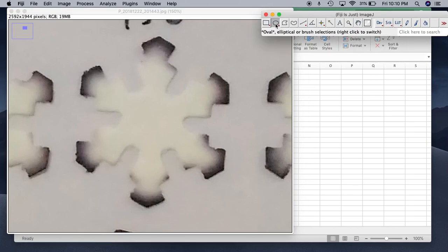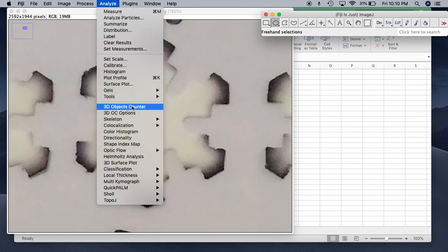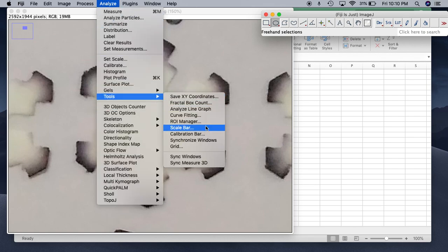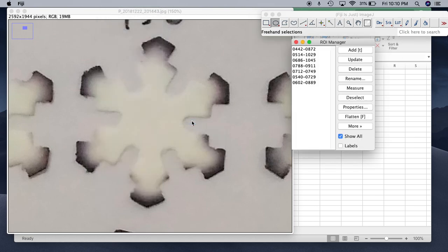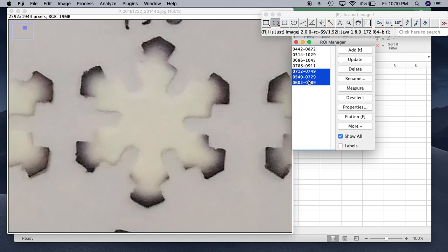Now the second thing I'm going to do is go to Analyze, then Tools, and ROI Manager. So I already have all the coordinates over here, so I'm just going to delete them.